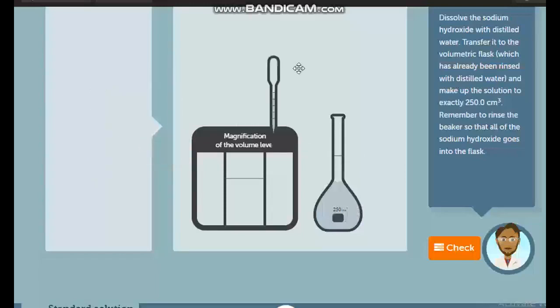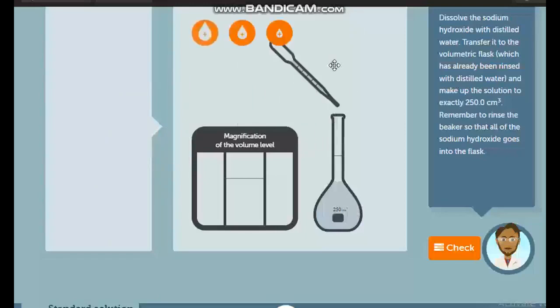So I will drag this into the working space and on the volumetric flask. So I'll start adding the water drop by drop. So you can see.